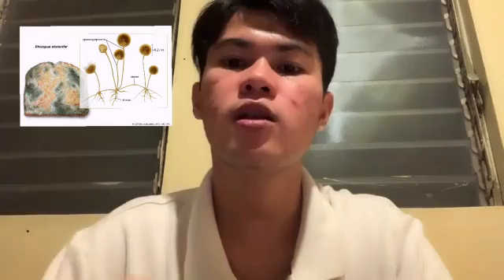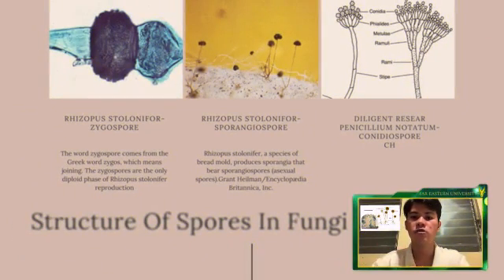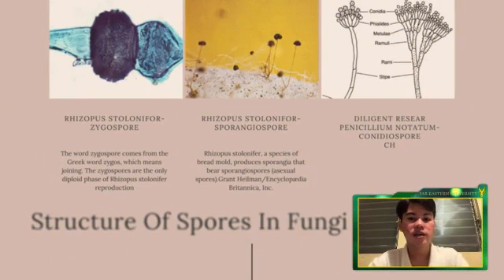The sporangia at the tips of the upright hyphae develop as bulbous black portions. Branching structures called rhizoids anchor the fungus into the substrate, releasing digestive enzymes and absorbing nutrients for the fungus. When conditions are good, the sporangia, containing numerous haploid spores which are produced through mitosis, release the spores into the surrounding atmosphere. These spores then may land on a moist surface and the life cycle repeats.